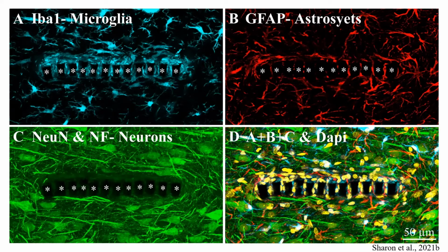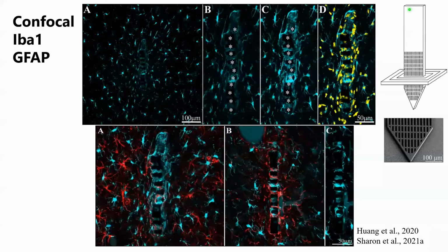In the first work, we conducted a very thorough investigation of the foreign body response using immunohistological methods. I will focus on a very small fraction of the results. For orientation, this is the platform. It is implanted vertically into adult female rat cortex. And those are the horizontal sections which define the shells around the implant. And here we are looking at the cross-section of a confocal image, and the platform is in the center. We measure the intensity of the foreign body response induced by our platform implant by examining the distribution and kinetics of microglia, astrocytes, and neurons.